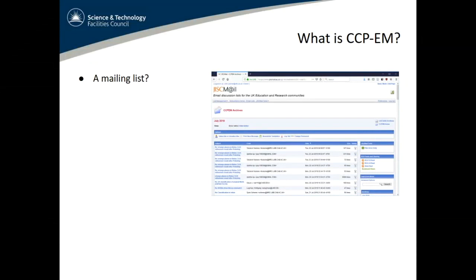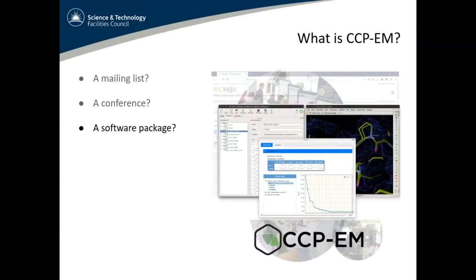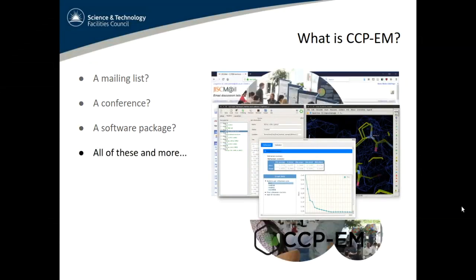So what is Ccp-Em? Start with a quick overview. Some of you might know Ccp-Em from the mailing list. We run a mailing list which is used for support for our own software, but also other software, so you may well know it from that. Some people, when they say Ccp-Em, they mean the conference. There's an annual conference we hold. It's a software package, that might be why you're here now. Actually, it is all of these things.